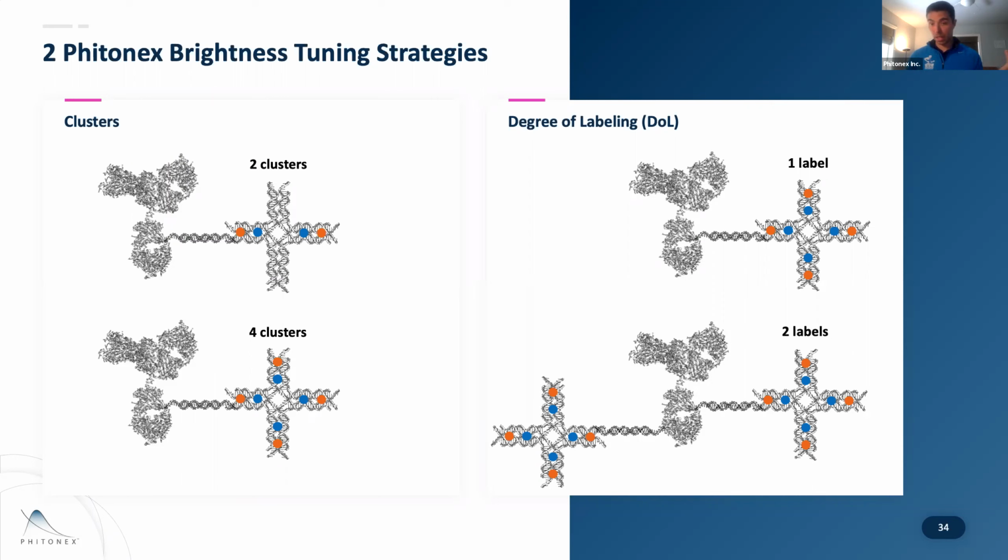You can wash the fluorophores out. And as I showed you, they don't really bind to the cell surface very well when we looked at that just doping fluorophore experiment. So it's very low hands-on, low number of steps. The way we've done this for our current labels is in a 6x100 microgram kit, to produce a sufficient amount of antibodies. We could do a really good number of tests with that. And we'll discuss that a little bit more at the end.